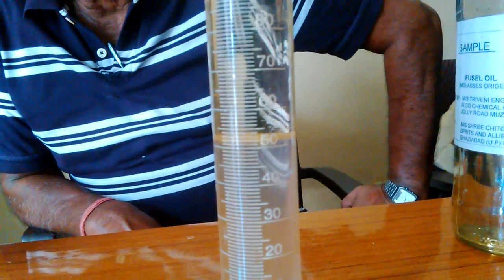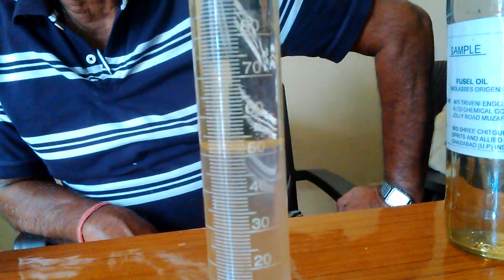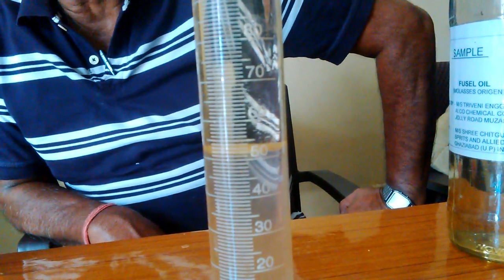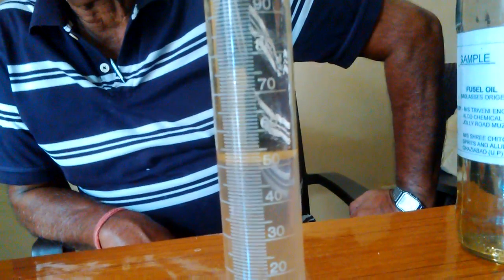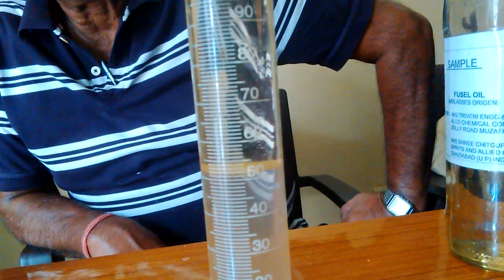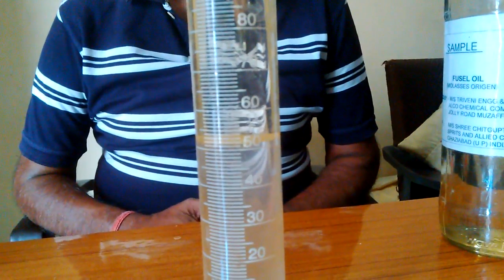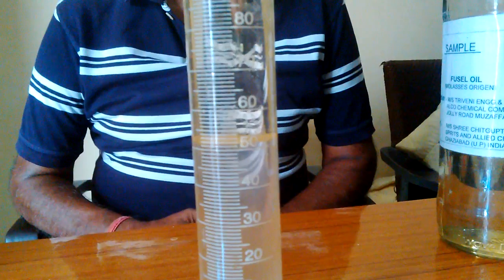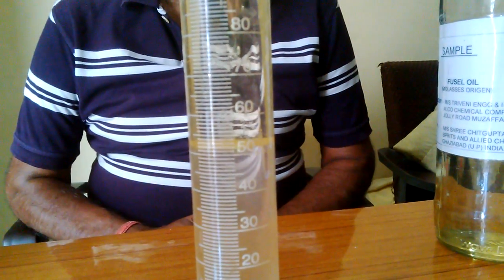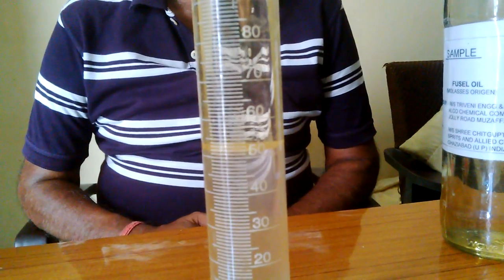That means the fusel oil is approximately 96 percent without moisture, and the moisture content in this sample of fusel oil is approximately 4 to 5 percent.